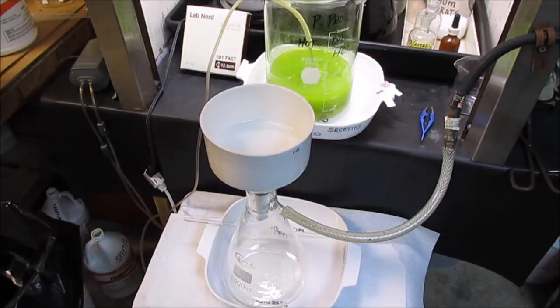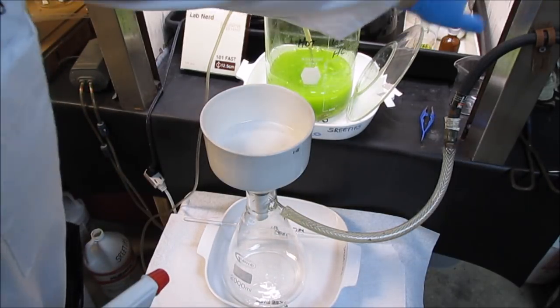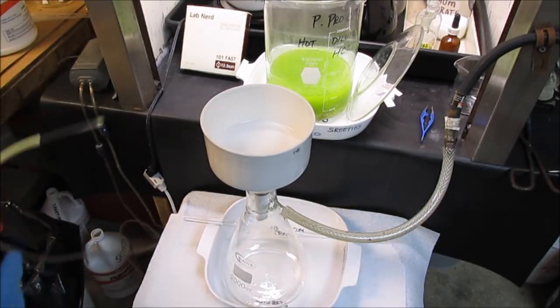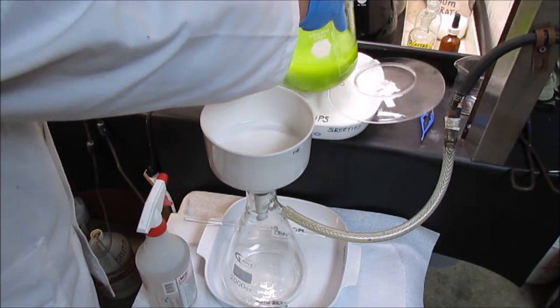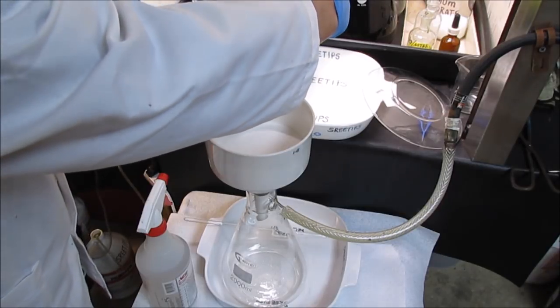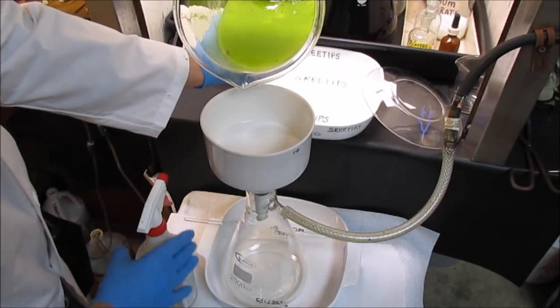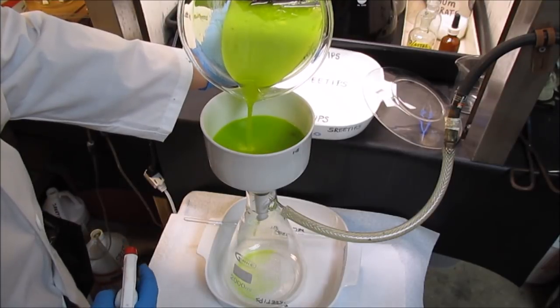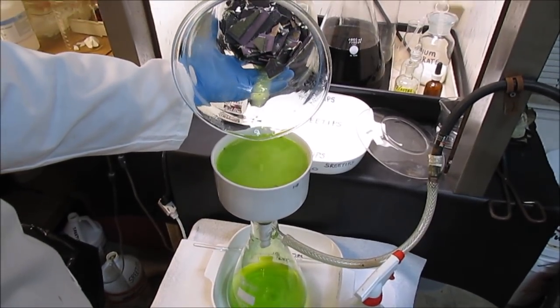I've had the solution on the bubbler for about 5.5 hours now. What I'm going to do is take it and filter it out. I've got a filter flask set up here. I'm going to go ahead and pour this right into a filter here. Got all the solution in the filter now.